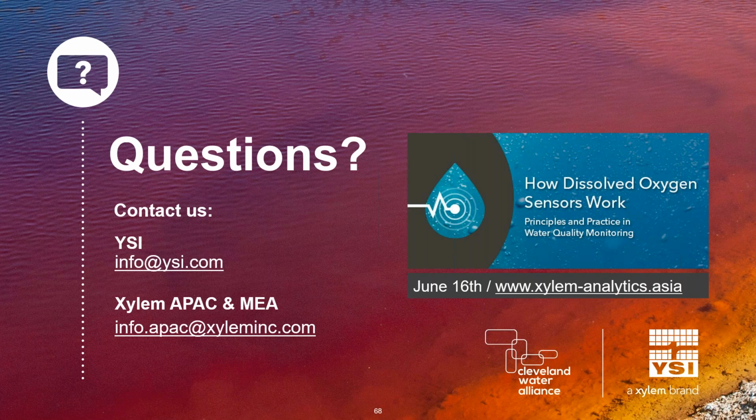I prefer starting with 7, and that's simply so you can see basically if your 4 or your 10 buffer was incorrect, you would not be able to instantly see that when you saw the millivolts. But if you start with 7 and you immerse it and you see that your millivolts are not within that positive negative 50 millivolts, then you immediately know that your pH probe is not working as it should be. So I would start with 7 simply because of that.